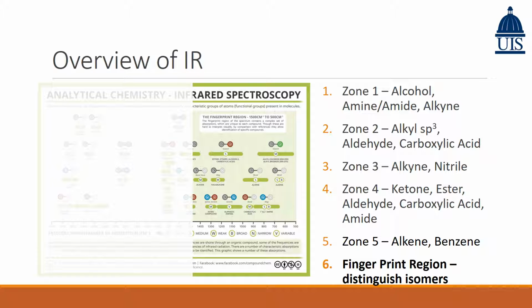However, there's one thing we've got to keep in mind, which is that sometimes there will be some big dips, and those could be due to haloalkanes, or these alkyl halide groups, halogens being present in our molecules. So that's definitely something to keep an eye on.